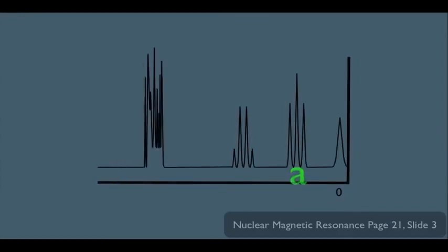This would be the A-type hydrogen, which remember we predicted would be a triplet. This would be the B-type hydrogen, which we predicted to be a quartet. But the C, D, and E hydrogens would be right here. What we're looking at is all of them are actually bunched up together, so tightly that we can't distinguish their actual splitting for each one.